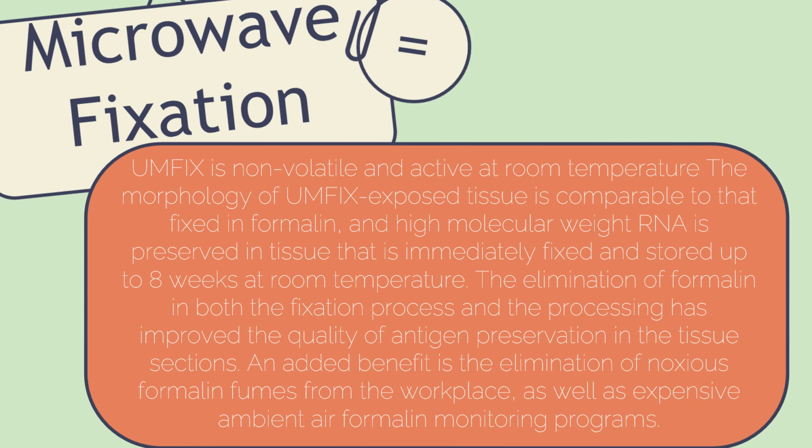An added benefit is the elimination of noxious formalin fumes from the workplace, as well as expensive ambient air formalin monitoring programs. Because in some laboratories, they have formalin monitoring programs so that formalin fumes will not be stuck in the same room, for they are very carcinogenic.